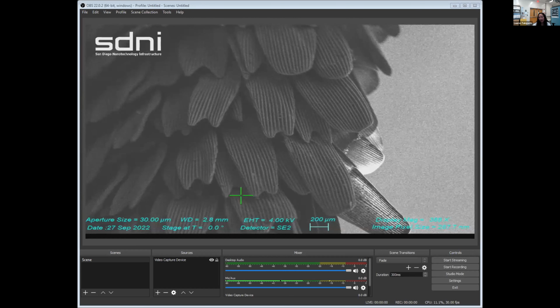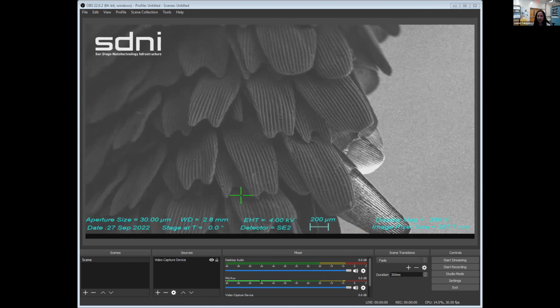As we heard earlier from Zach's presentation, visible light is in the nanometer scale range, from about 300 to 700 nanometers. And the blue morpho butterfly is an excellent representation of how fundamental structure, instead of a chemical like pigments or dyes, creates a color. So we're going to keep going in on the wing. As you can see, there are all these little ridges on the individual, I don't know what you call them, feathers, scales.